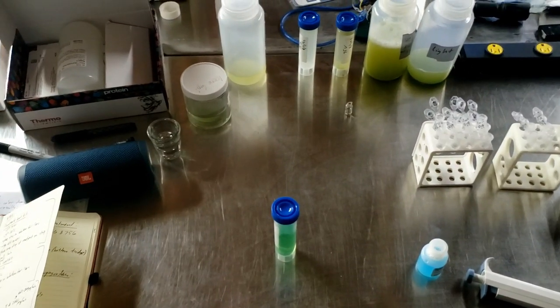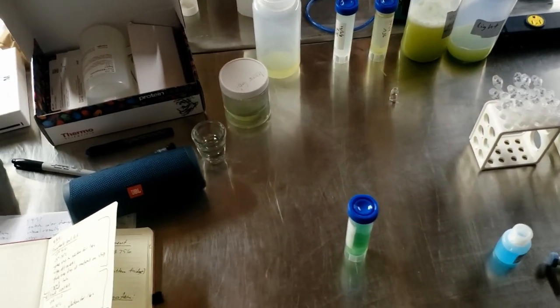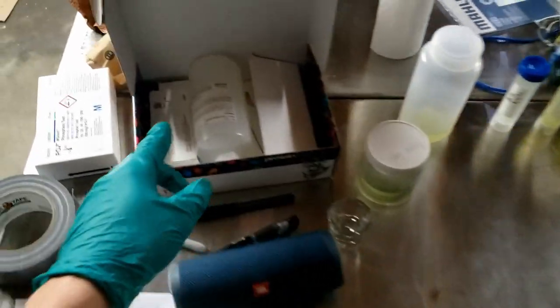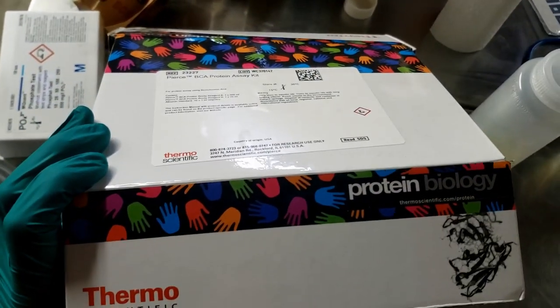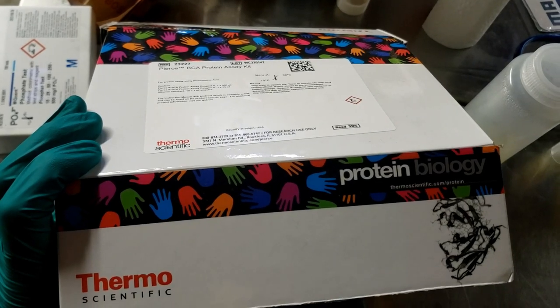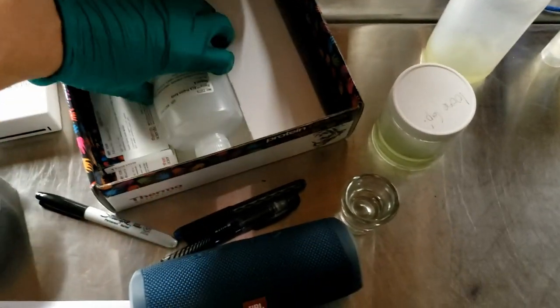Alright everyone, this is going to be the fastest protein assay tutorial you've ever seen. This is the Thermo-BCA protein assay. I think it's about $100 to purchase it.